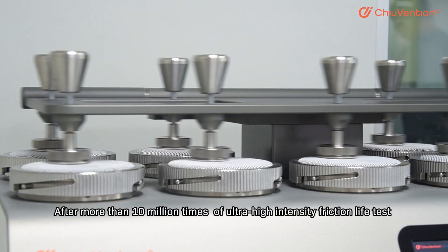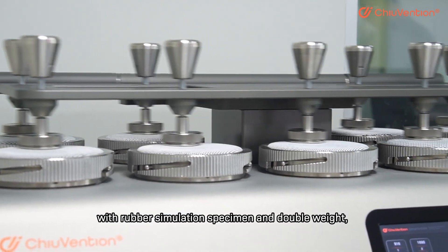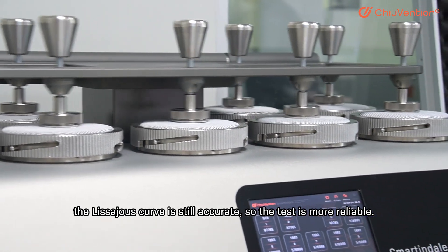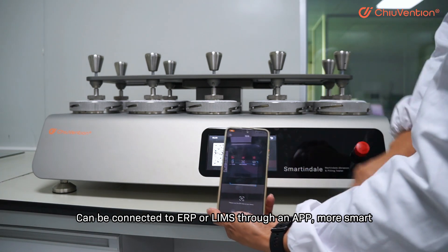After more than 10 million times of ultra-high intensity friction load tests with rubber simulation specimen and double weight, the Lissajous curve is still accurate, so the test is more reliable. It can be connected to ERP or LIMS through an app — more smart.